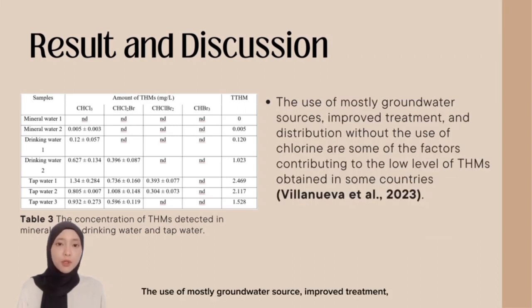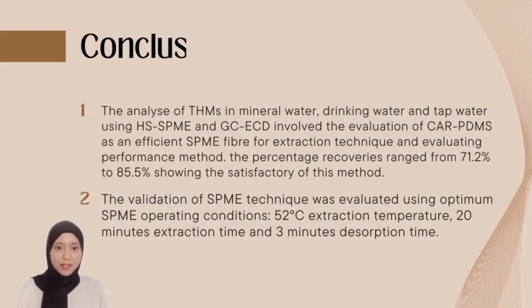The use of mostly groundwater sources, improved treatment and distribution, and treatment without the use of chlorine are some of the factors contributing to the lower level of trihalomethanes obtained in some countries. This statement supports why mineral water has little to no concentration of trihalomethanes.